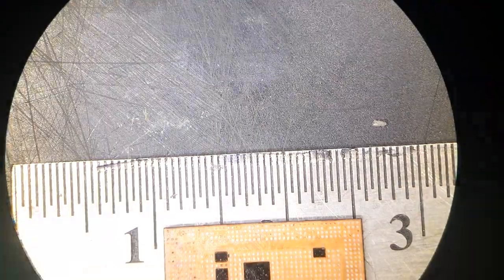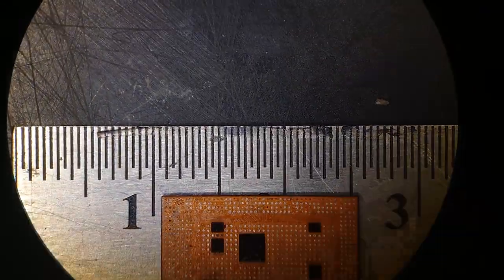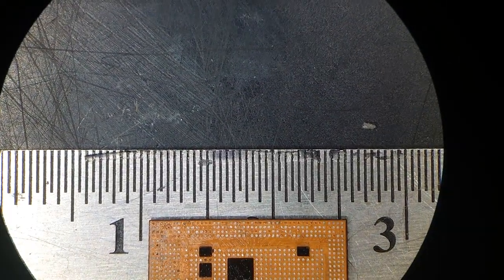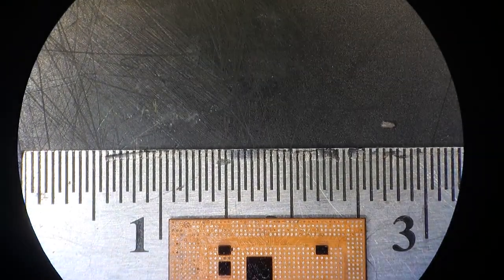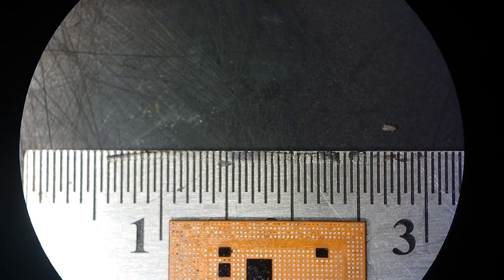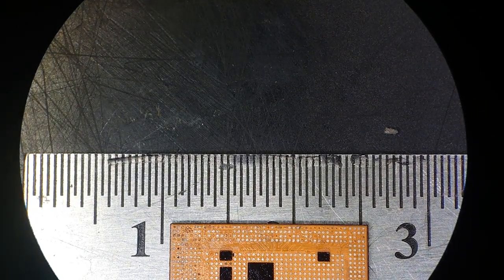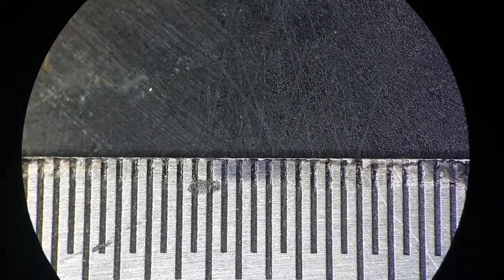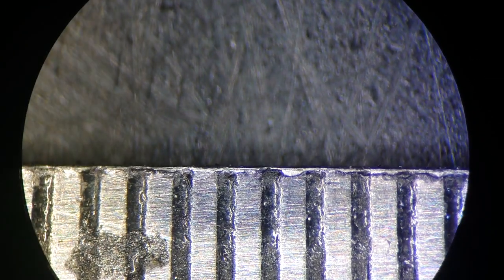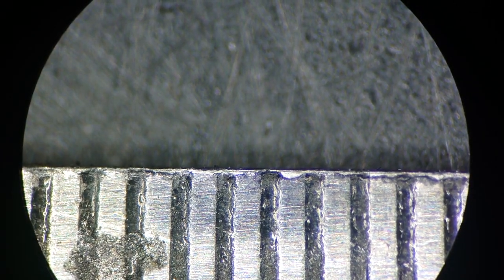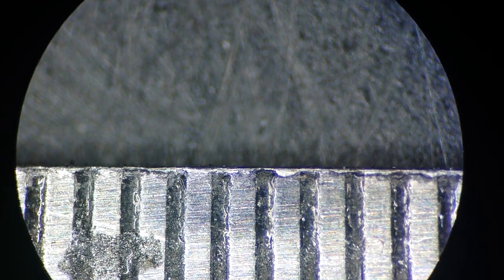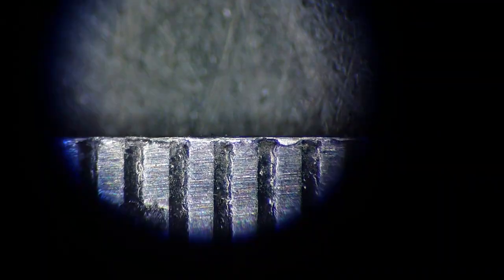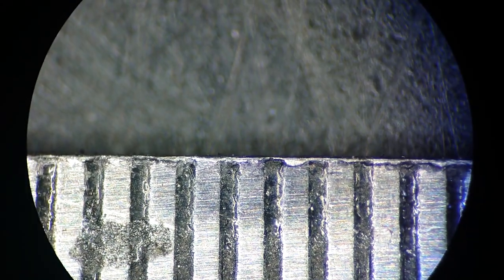Let's see the field of view of our Olympus with the lowest magnification. We have 34 millimeters, even a bit more, I could say even 35 millimeters of field size. Now let's make a little magnification and see the size at maximum zoom. It looks like it has nine millimeters field of view with maximum magnification here.